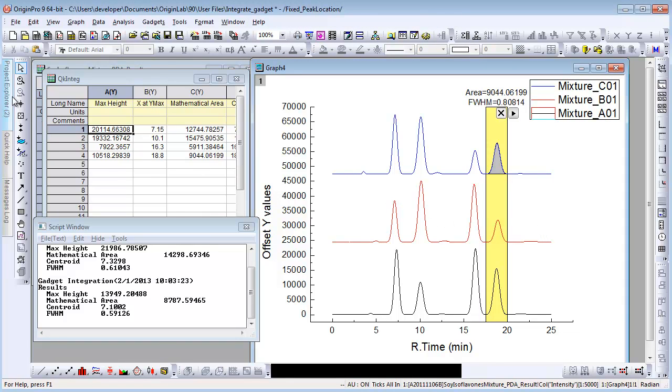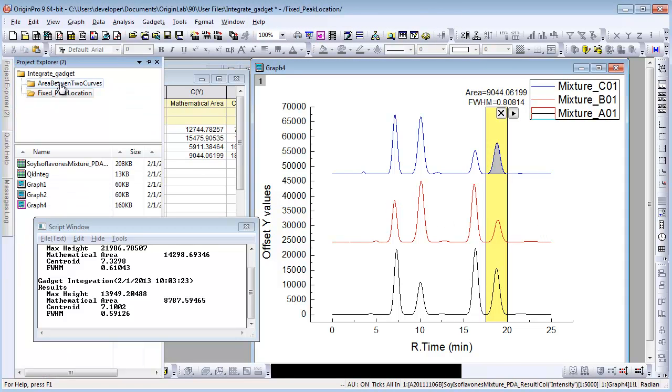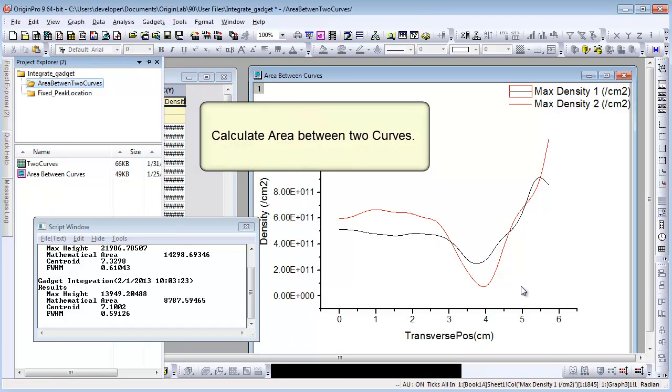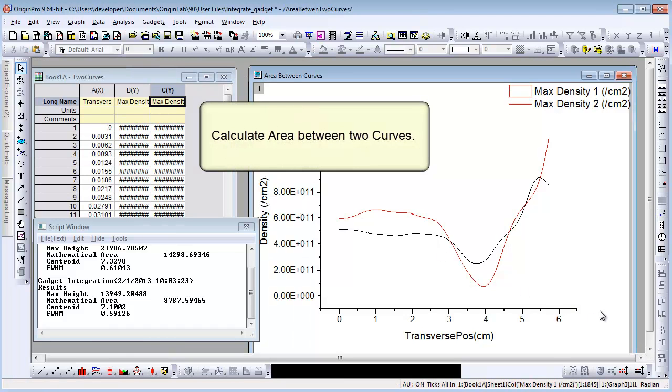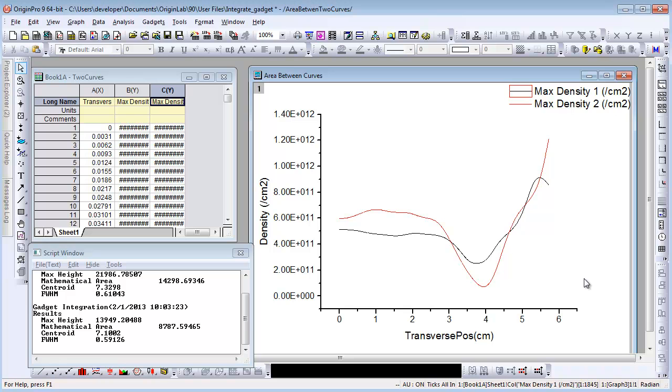Now let me show you how to calculate the area between two curves. There are two data plots in the graph. MaxDensity1 is the active plot which is indicated by the red frame in the legend.